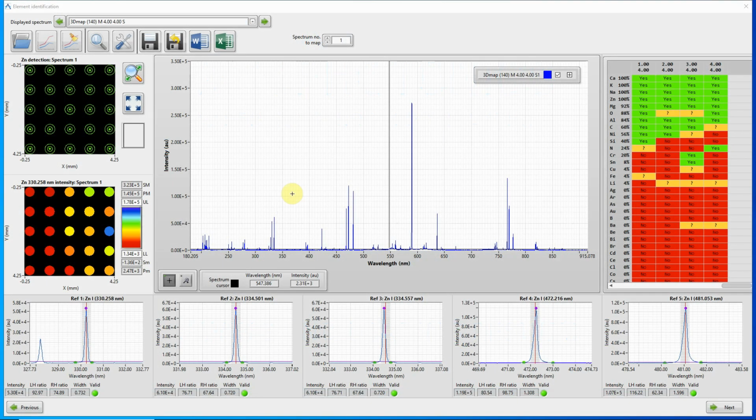As demonstrated in a previous video, the user is given the option to save the result data on completion of the analysis. However, the results can be saved at a later time if required by selecting this shortcut button in the toolbar.